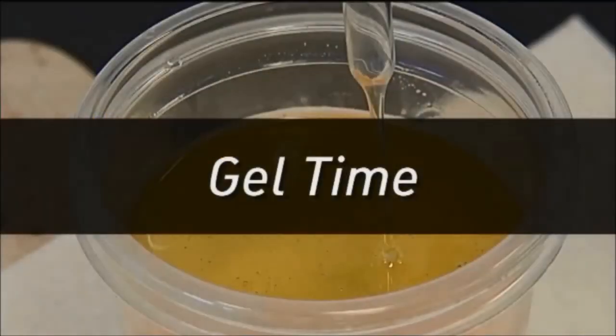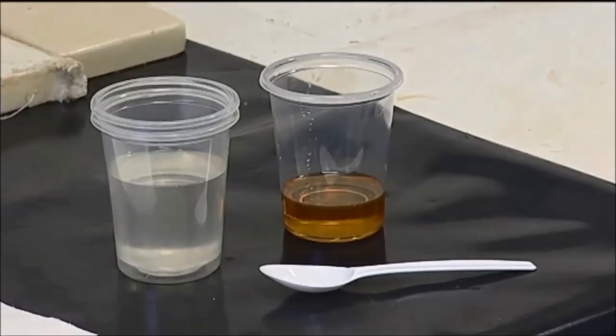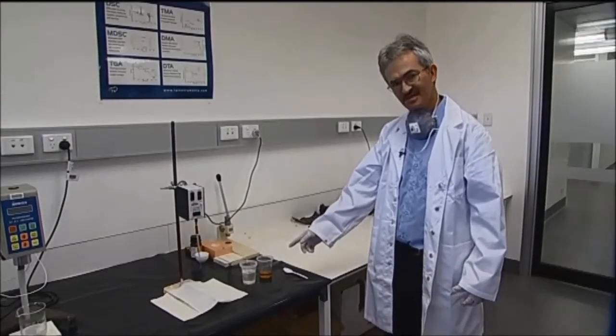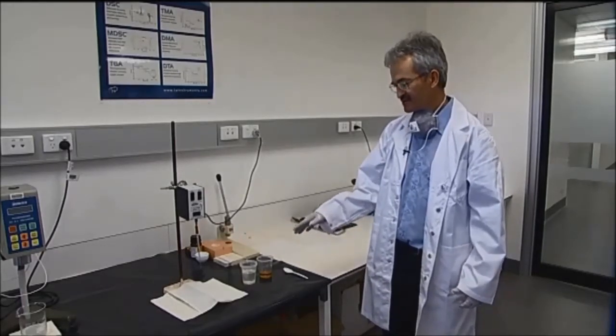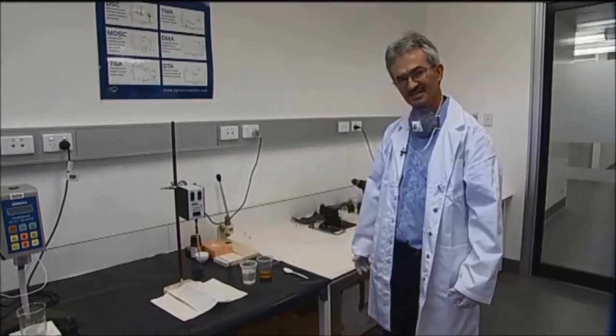Gel time is the time required for a thermosetting resin to effectively solidify from liquid state to gel, from the introduction of a catalyst into a liquid adhesive system. Here we have an epoxy resin, part A and part B — the epoxy and the hardener — and we are going to measure the gel time, which is the time required for the resin to cure, to go from liquid to solid state.